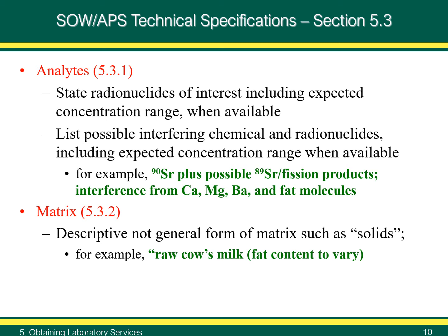Consider that a general description, such as liquid, describes drinking water or oil, or even elemental mercury, matrices that would pose very substantially different challenges for a method. A descriptive matrix will be specific enough to identify characteristics that could substantially impact method performance. If we were just looking at a water, for example, an adequate matrix description might be brackish groundwater with sodium chloride content up to 7%.